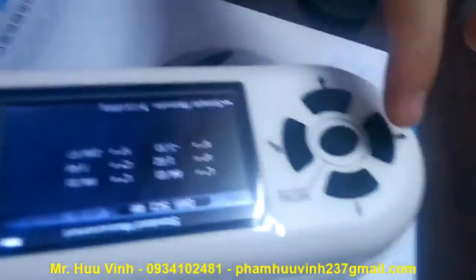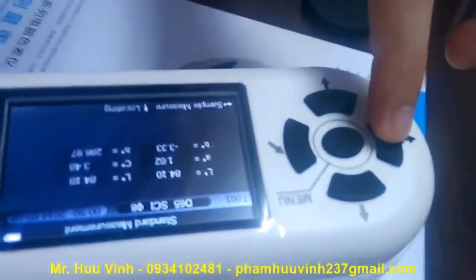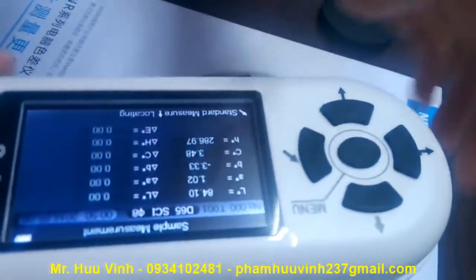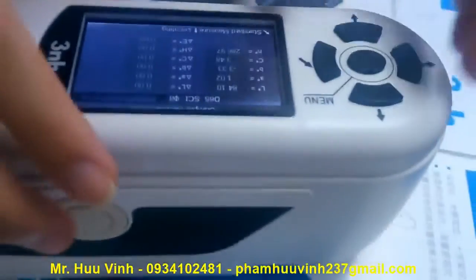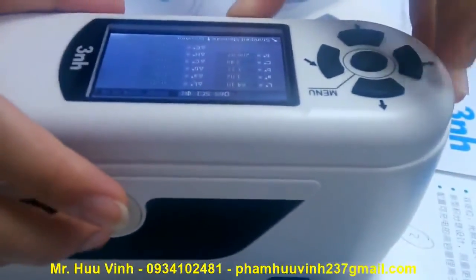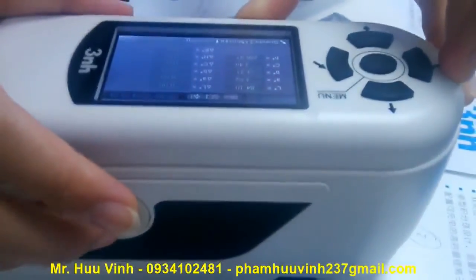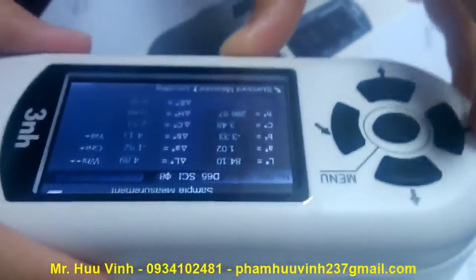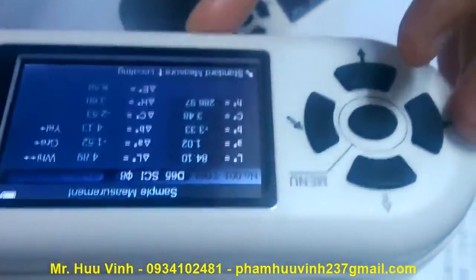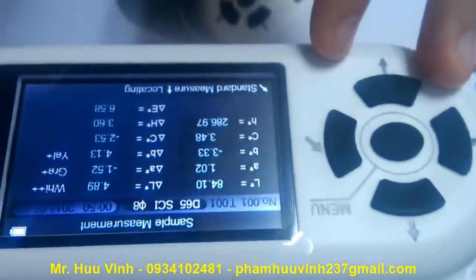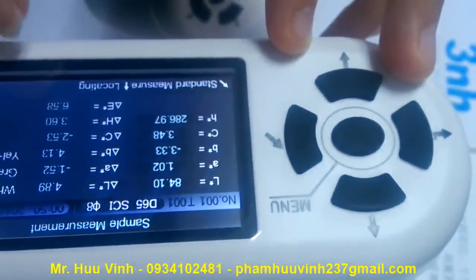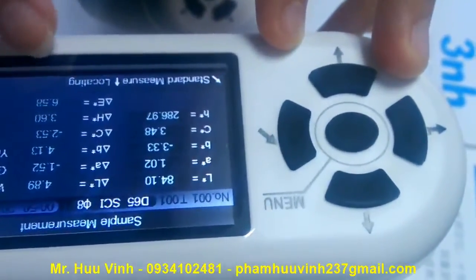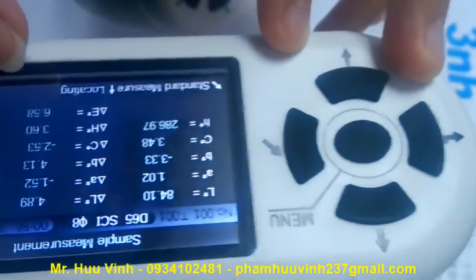Then press the button here and change to number two sample, and press the test button again. We will hear the click sound again and the data will change. You can see there is a data value E — it shows if the two products are the same color or different.